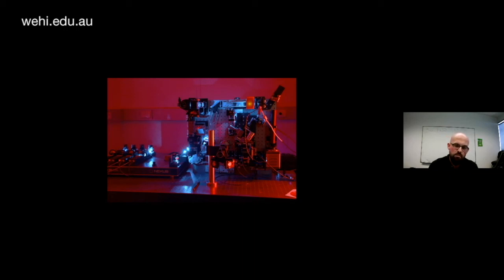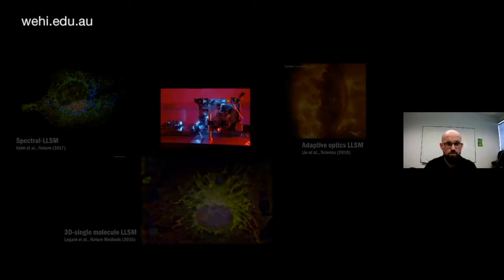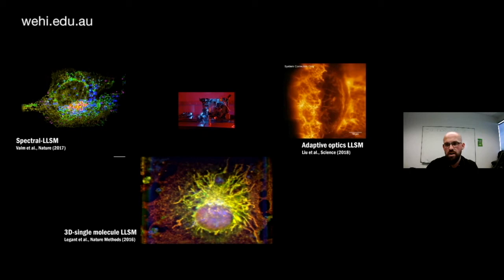You've got a bank of lasers, which are really great. You've got some really expensive camera technology, some really high quality optics. So we can take this and do the next level of development with it. And just to give you some examples of where this technology has been taken by various groups, firstly, we could take 7 lasers and try to do hyperspectral imaging of 7 interacting organelles all at one time. Or we can, oh, my PowerPoint just crashed there.